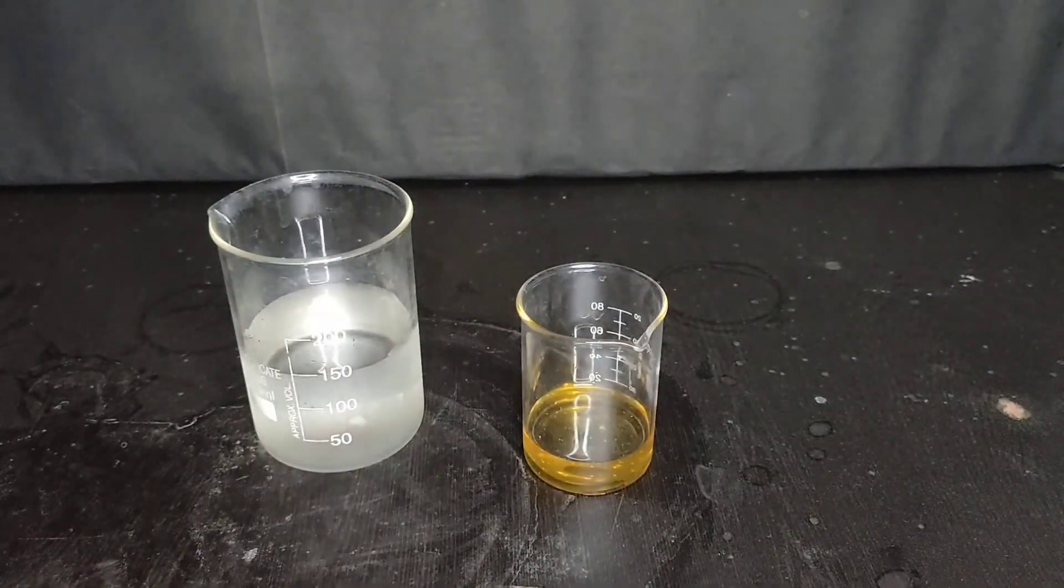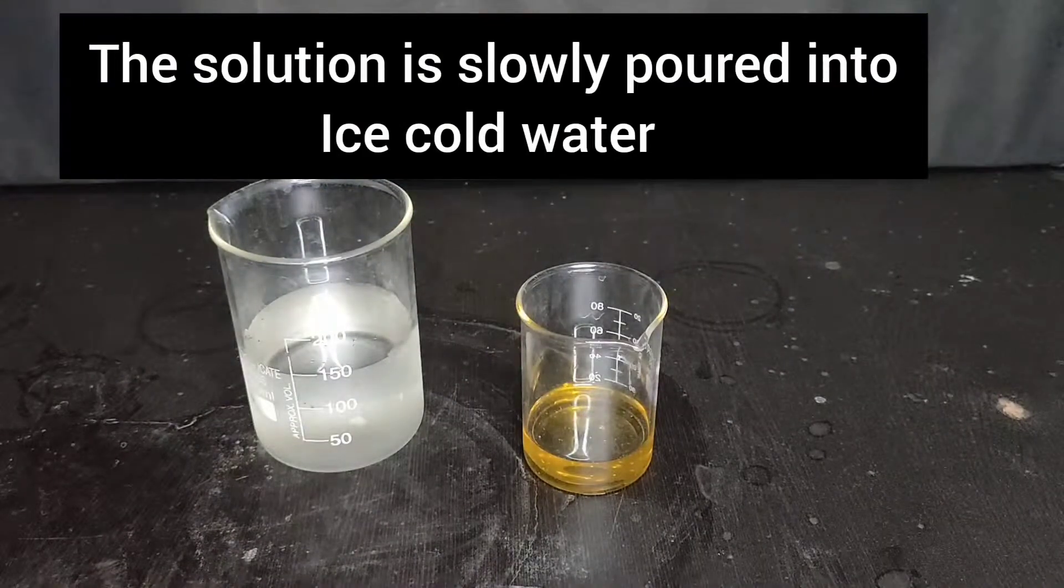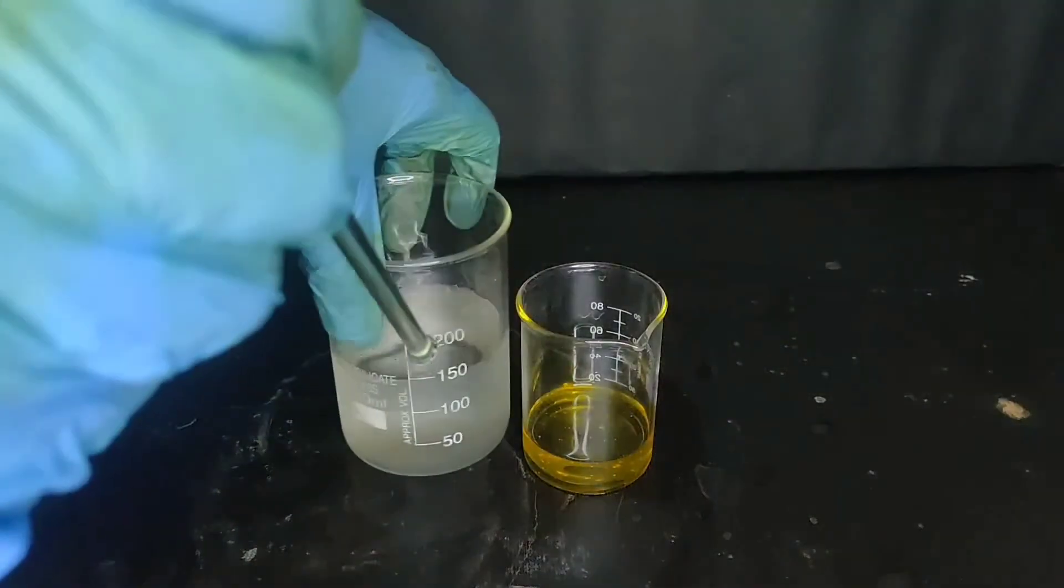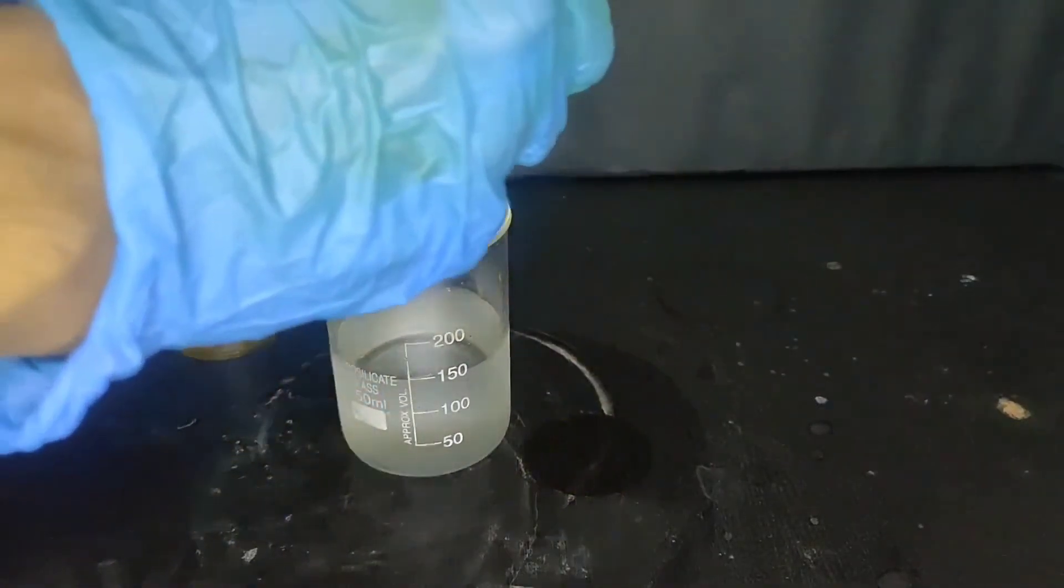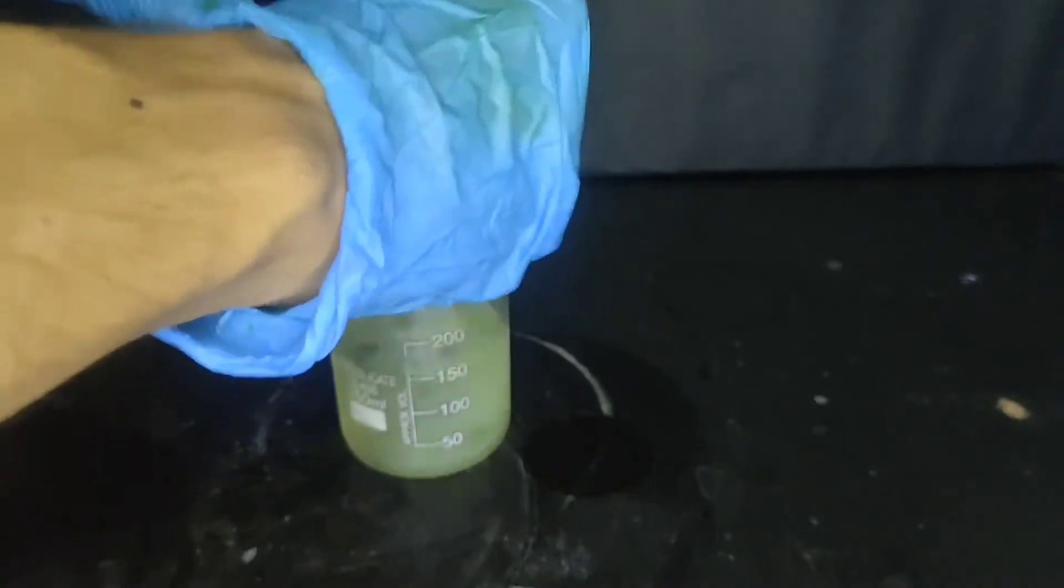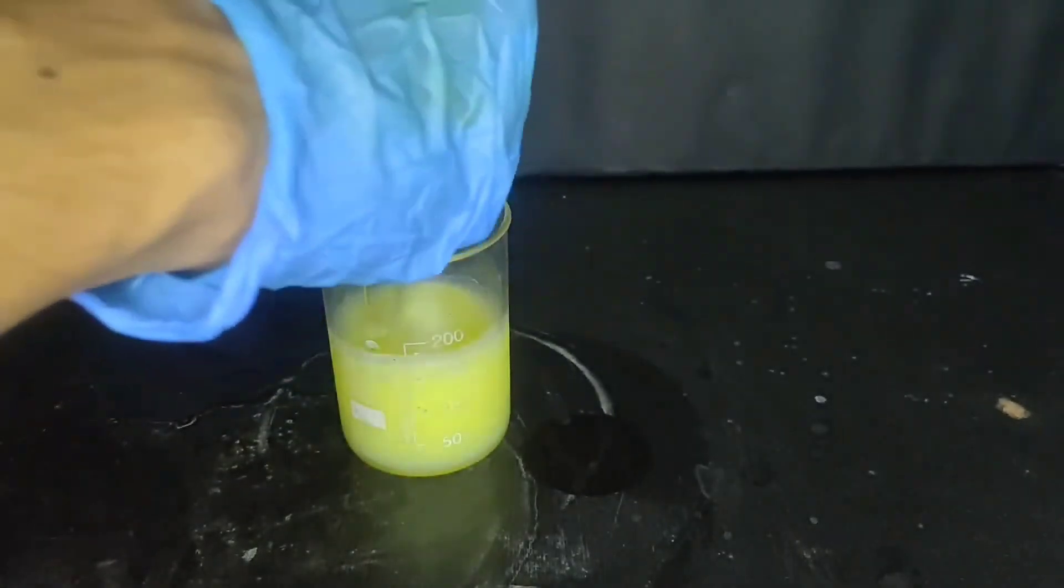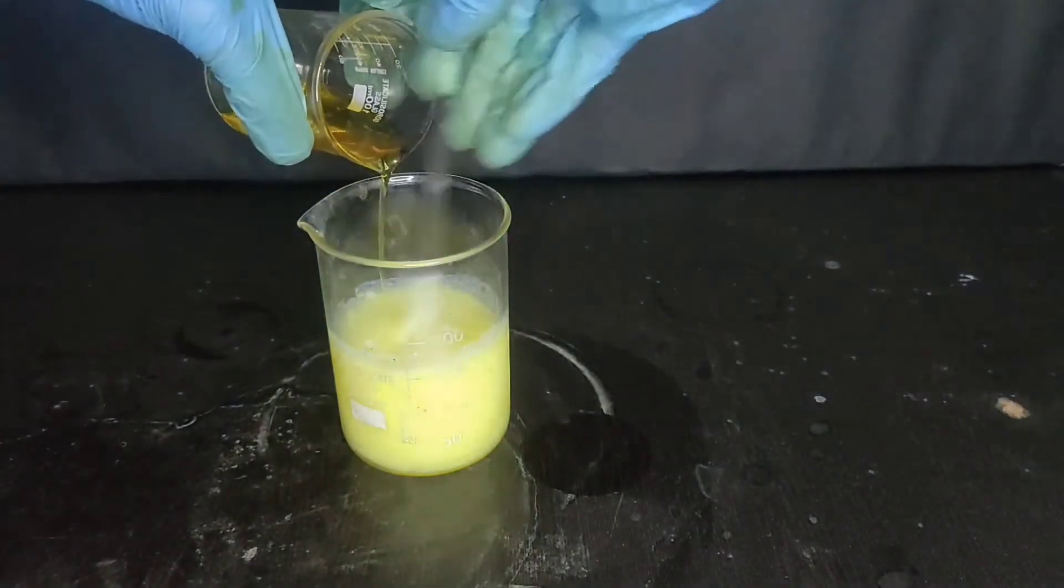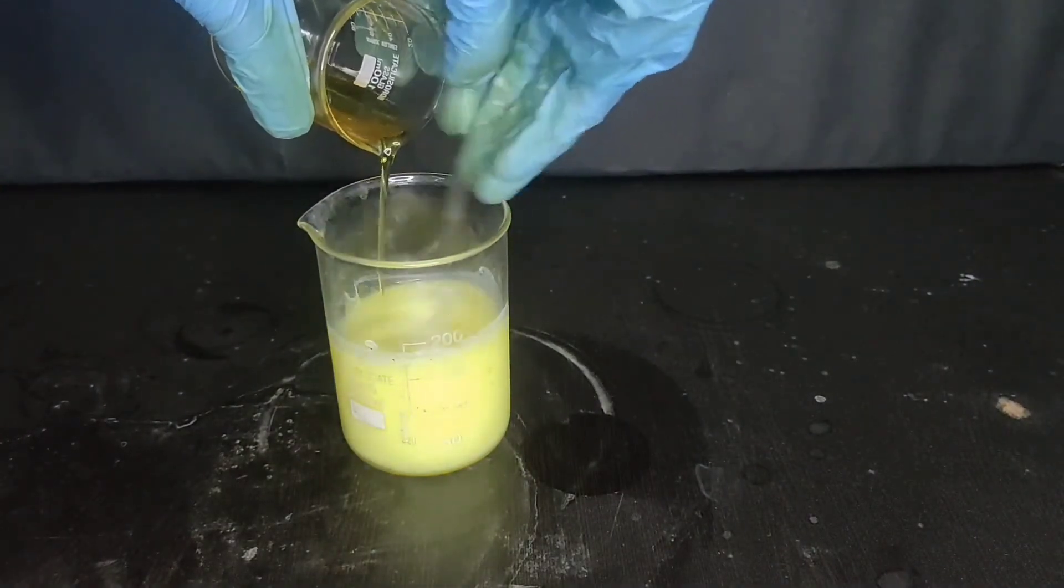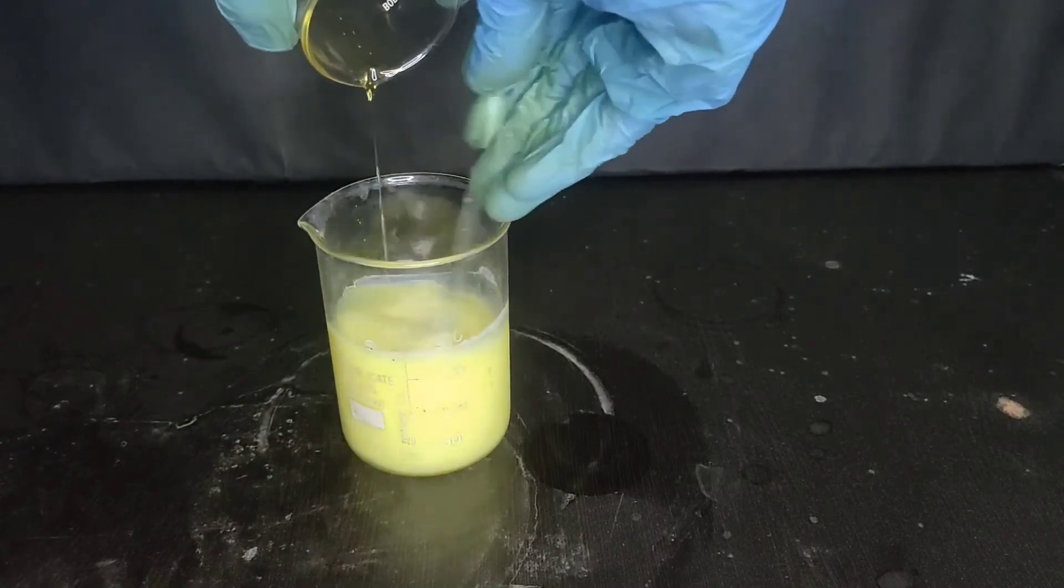After 1 hour, the solution is slowly poured into ice cold water with constant stirring. You can see that para-nitro acetanilide is getting precipitated. The ortho product being more soluble stays in solution.